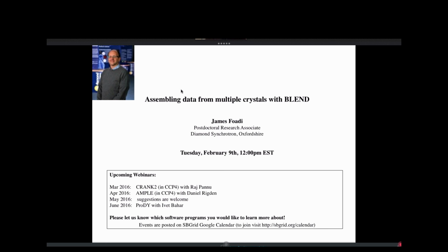I'm also trying to come up with a better way to spot this decay due to radiation damage at the beginning. The procedure we have right now is with the unscaled data. So it's very little processing being done on these data sets at the beginning, basically only the averaging of intensities in reciprocal space.